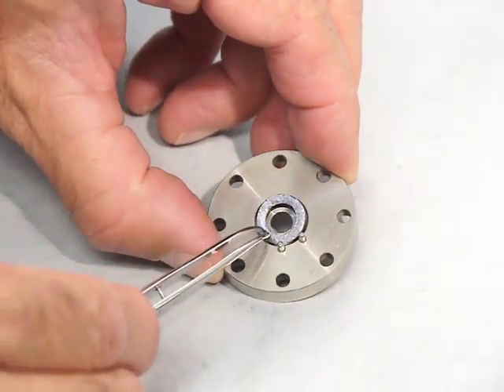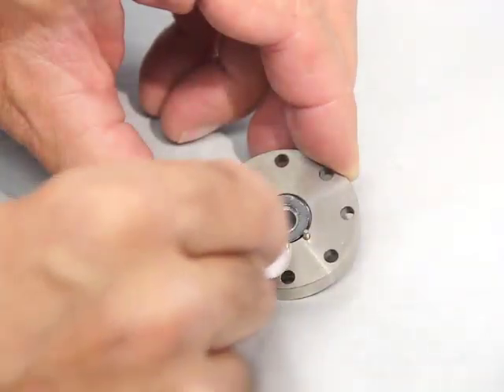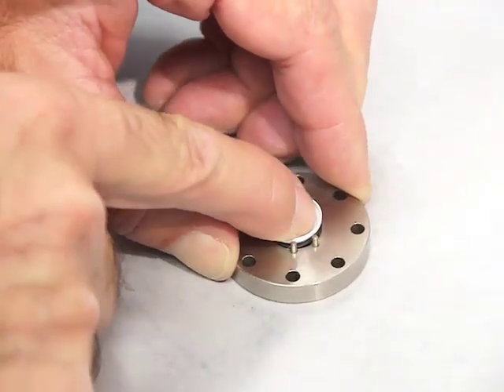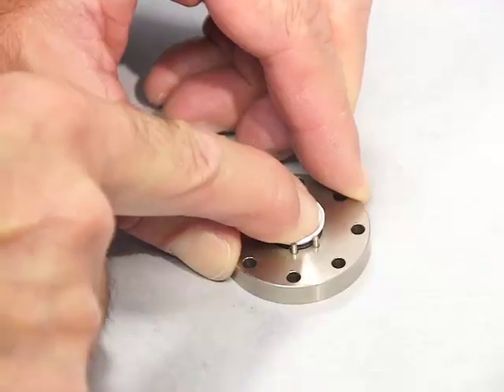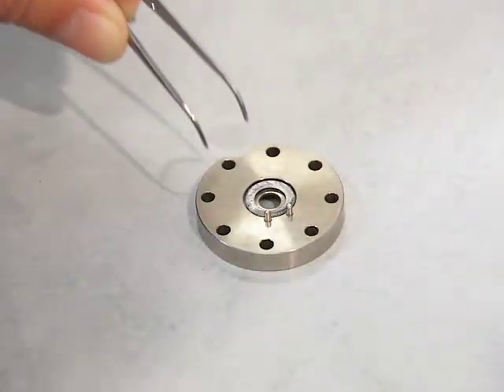Place the new gasket in the end cap and compress it evenly, slightly down below the end cap surface. Position the window in the well.